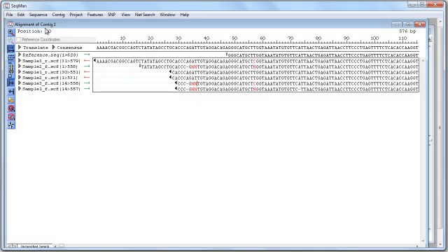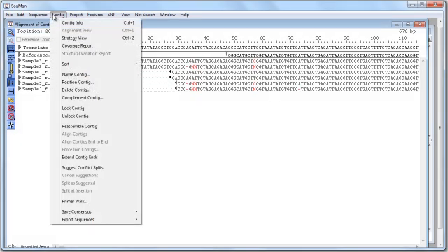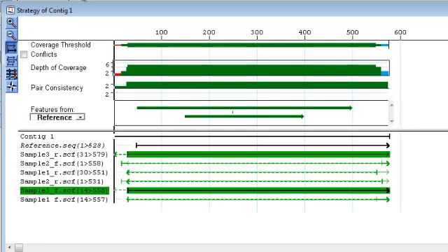Open the strategy view to see a graphical representation of assembly coverage and pair consistency.